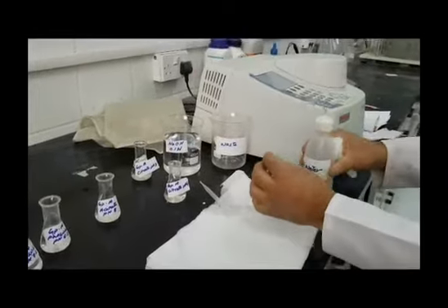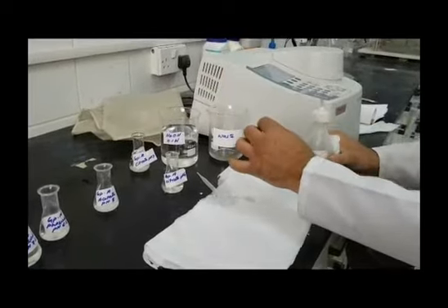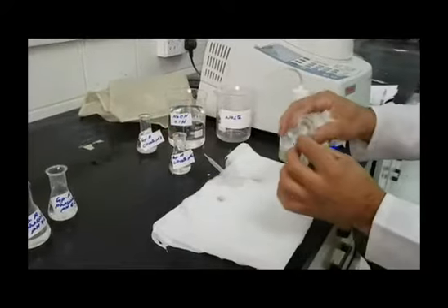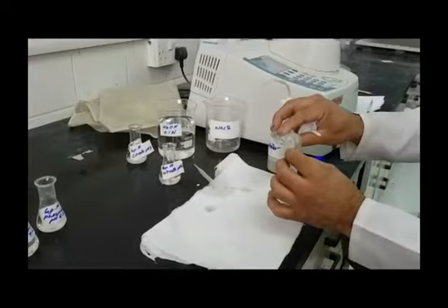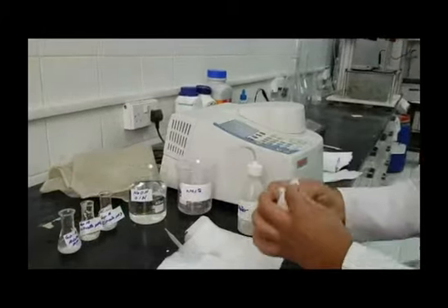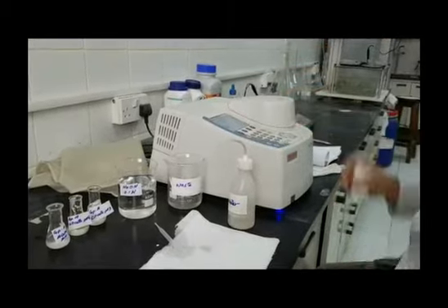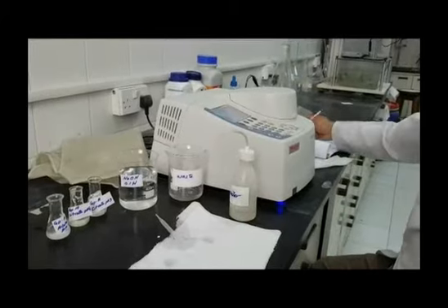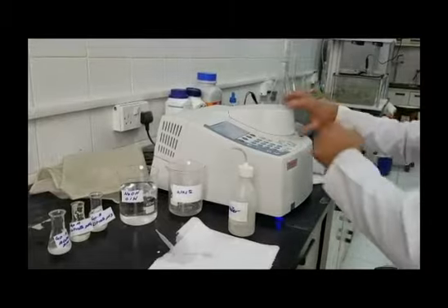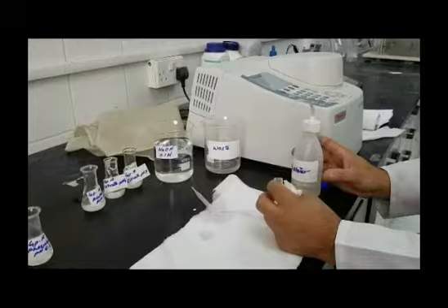Continue measuring the absorbances and recording of the results. Remember to rinse the cuvette in between measurements using distilled water. And it's necessary to completely dry the cuvette before placing it in its position inside the UV spectrophotometer, using a very soft tissue.